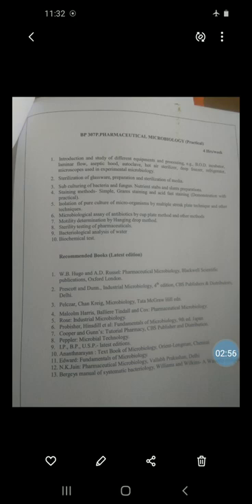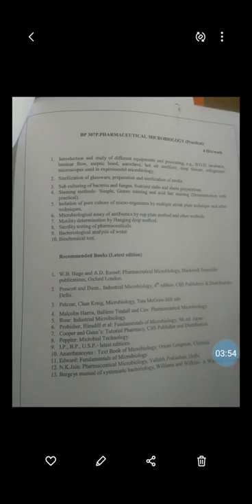The medium is then poured into petri plates and allowed to solidify. Then incubate all the plates under suitable conditions for growth of microorganisms. A series of agar plates shows a decreasing number of colonies resulting from the dilution technique. If this technique is performed by serial dilution method, that is by use of a pipette, the counting of microbes is possible. So this is the principle of this practical.